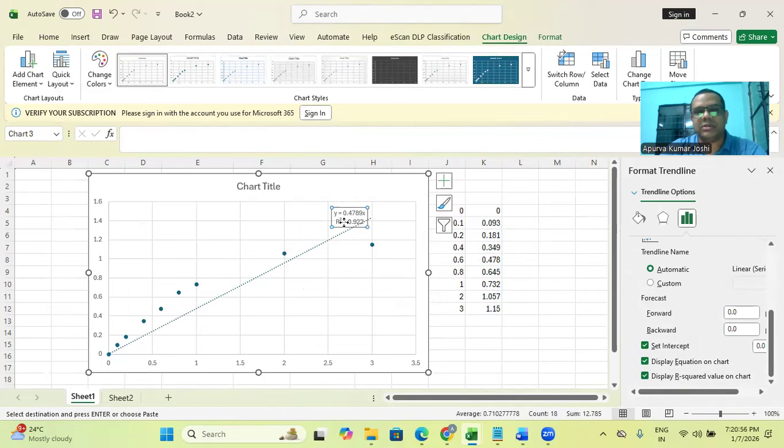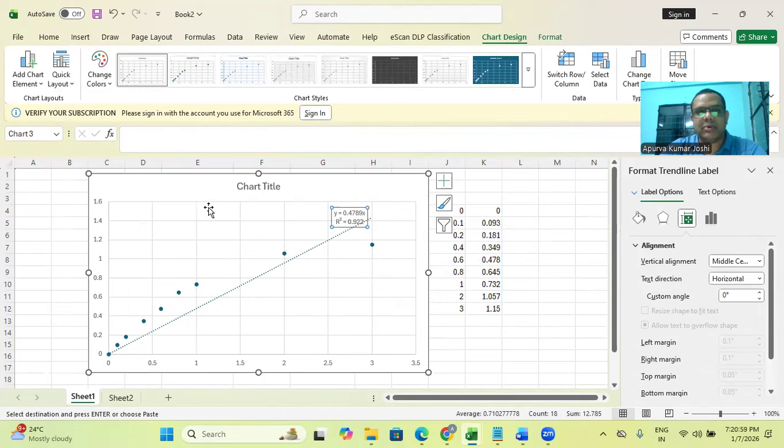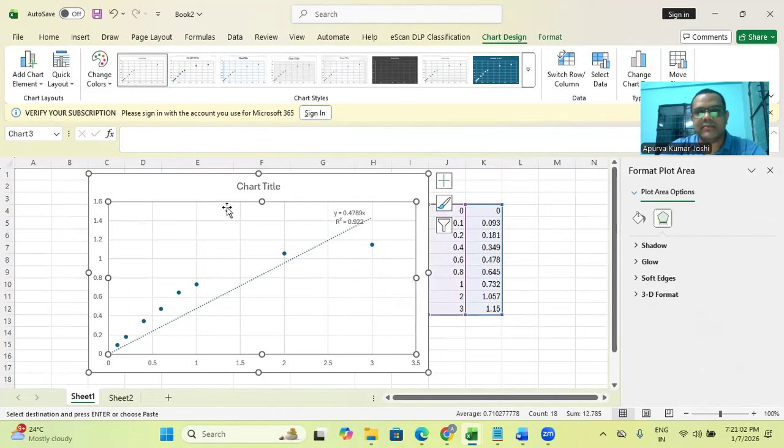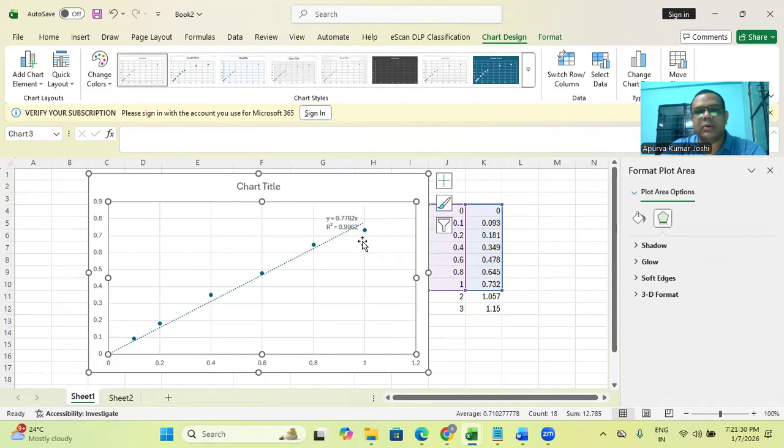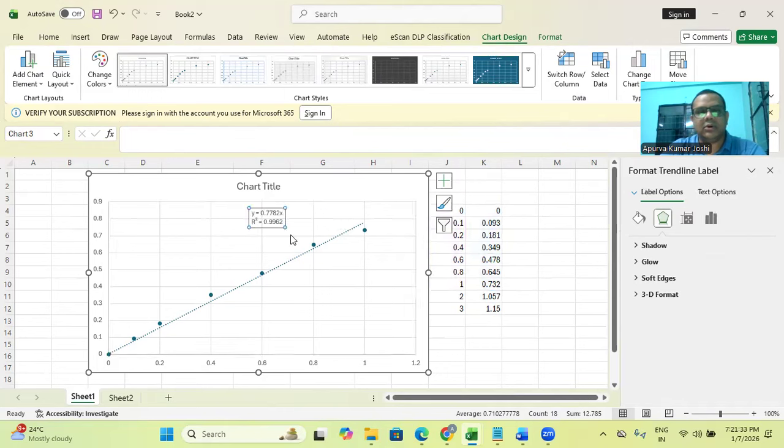It's horrendous. Now, I'm going to place the cursor over the graph, which will allow me to select the data set, and I'm going to decrease the range of the concentration to see up to what point we get a satisfactory visual observation of a linear relationship between the two variables, the two parameters. So I'm going to reduce the range. Let's see. Still not very linear. Still not very linear. Fairly okay, but I wouldn't accept it. Although the R square value is good, I still will not take it.